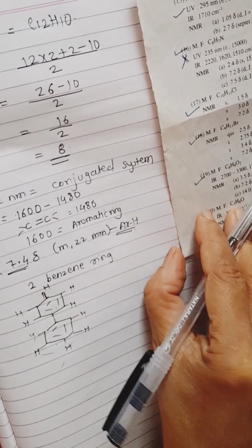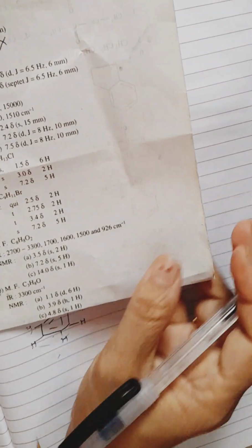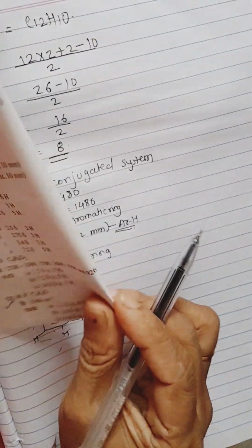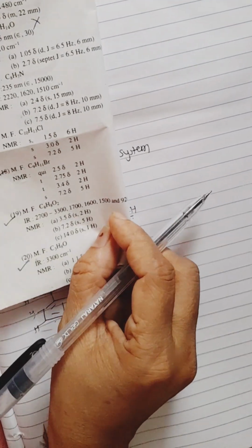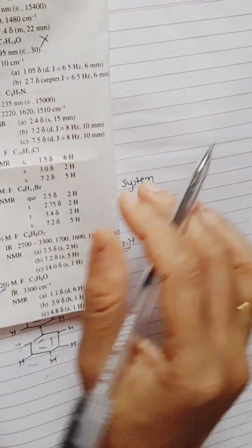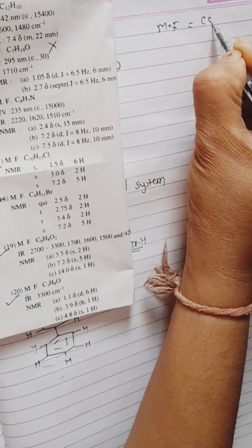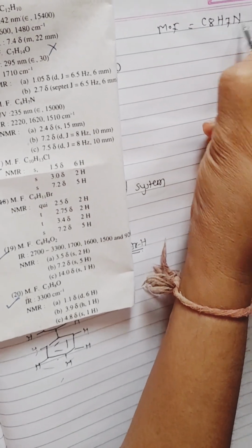Now let's start to solve the second numerical, or second problem, based on NMR. I hope it is visible to you. The molecular formula is C8H7N.